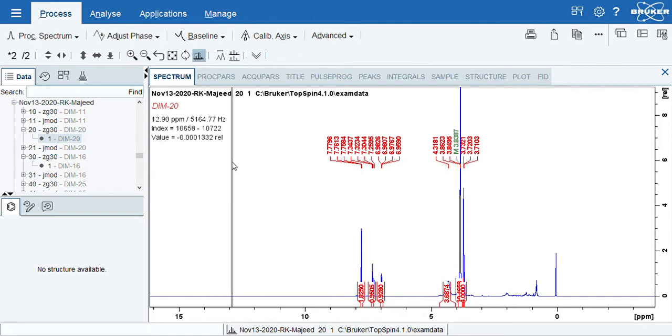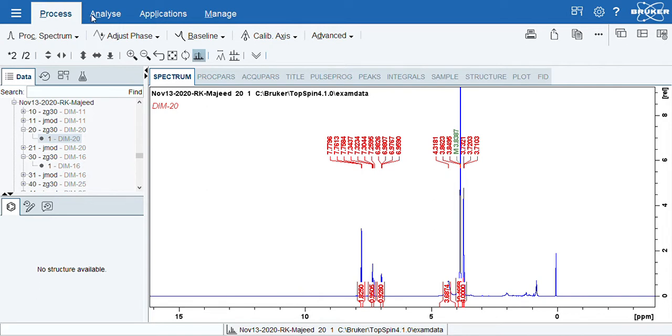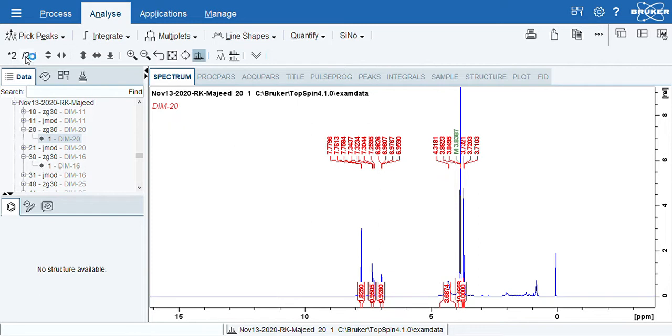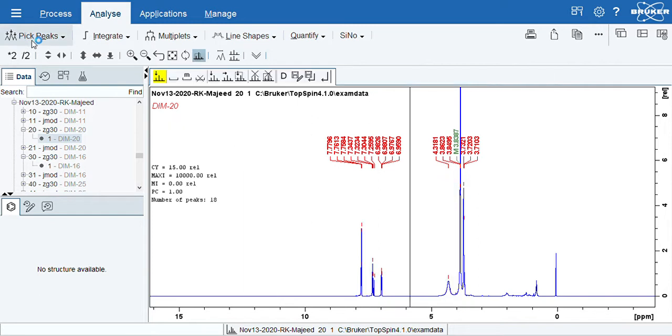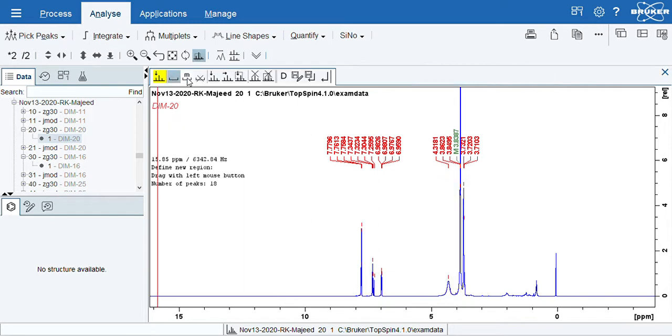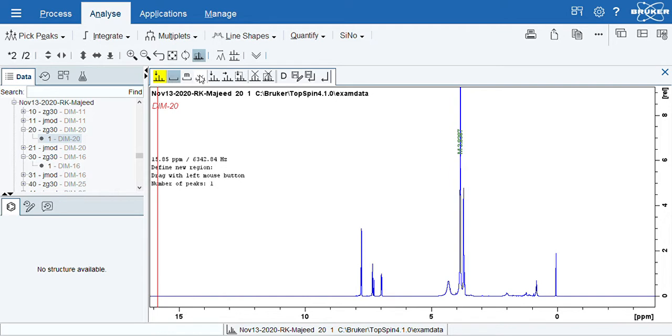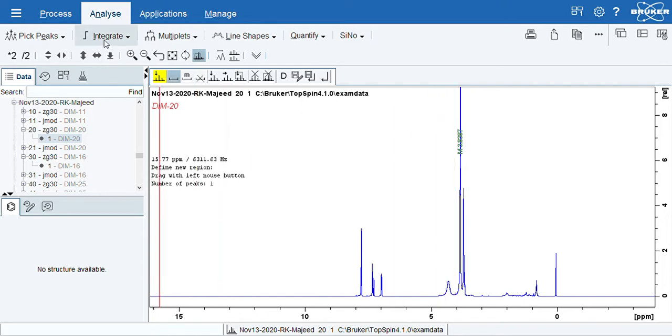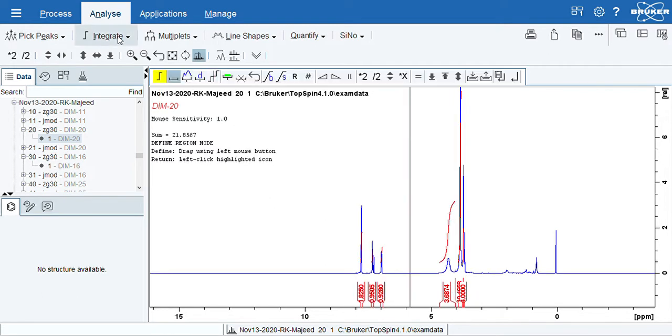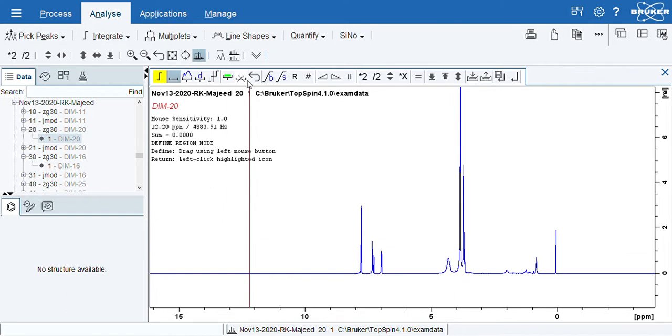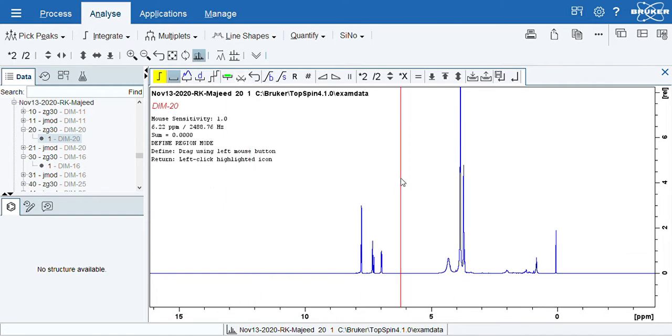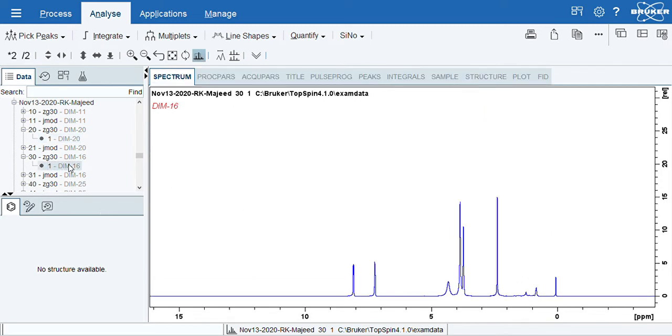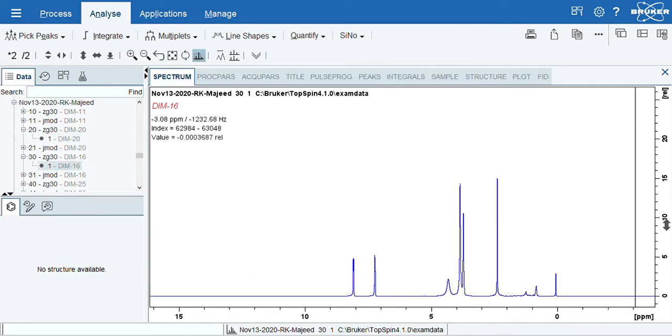So what we do is we go in Analyze, then we go on Peak. We just select Peak, then select all peaks and delete it. Then we go back to Integrate, then we just select and delete everything. Before, after deleting, you need to save and continue. So doing this, now my spectra looks this way.